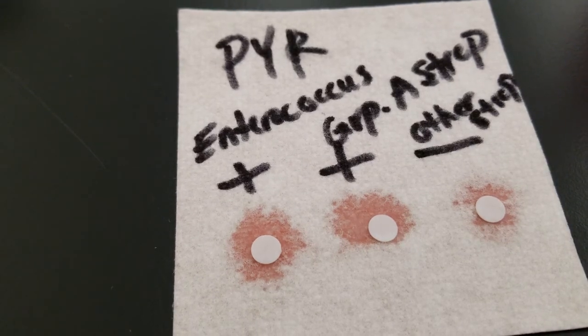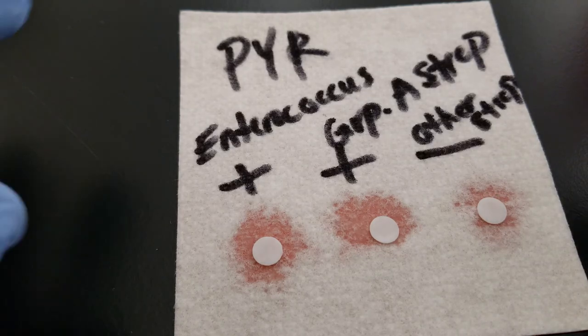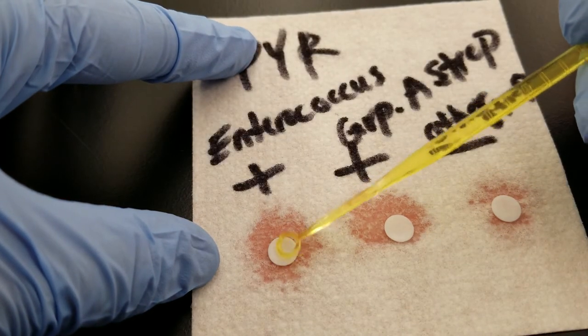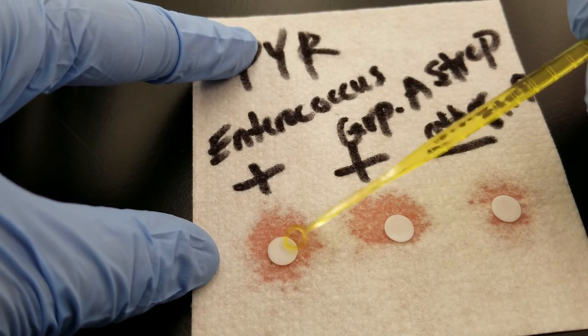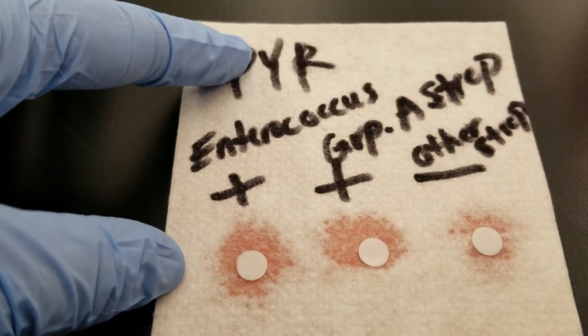The next thing we're going to do is get a new loop and get our organisms and put them on there. The first one we're going to use is Enterococcus faecalis — that should be a positive test result. You want to get two to three colonies and put them onto the wet filter paper, spreading it all around so you get some really nice color development when we use the next reagent.